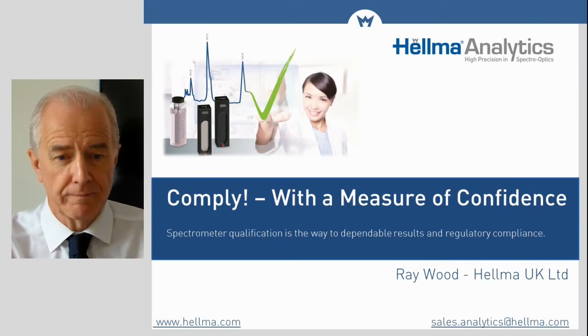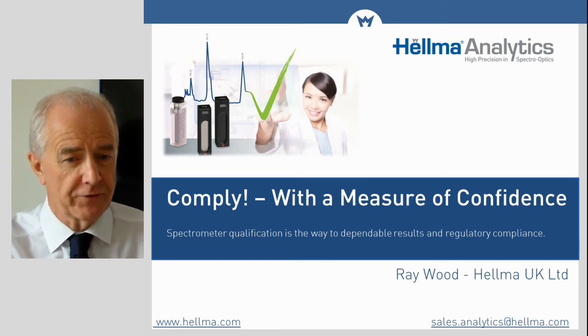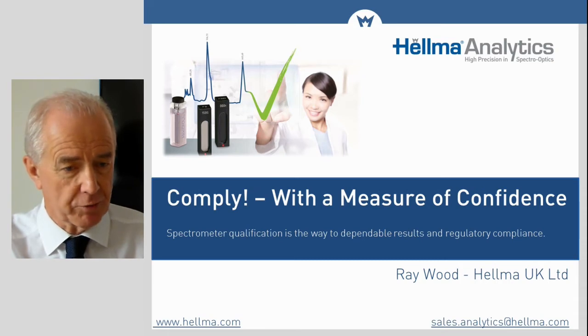Hello and welcome. I'm Ray Wood from Hellma UK, and today we are going to look at the performance qualification of UV-Vis spectrometers, both in general usage as well as where compliance to the European Pharmacopoeia is required.